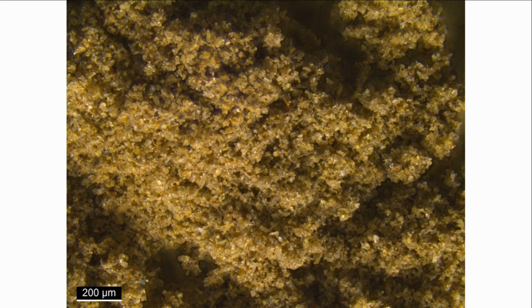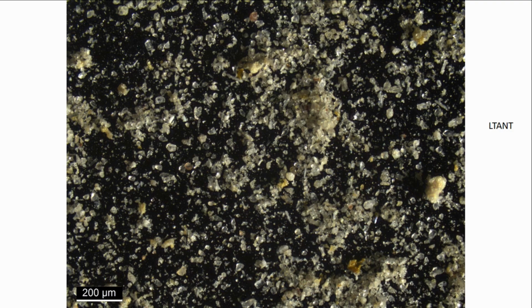Here's the silt and clay that passed through a 53 micron screen. That's a screen about as fine as a tea bag, about 2/1000ths of an inch. Notice the grains look like tiny beach sand. The soil is low in clay, so the surface of the silt grains are pretty clean. But here's the same soil after boiling it in acid. The acid removed the organic matter. The yellowish or brownish color of soil comes from a film of organic matter coating the surface of the mineral particles.